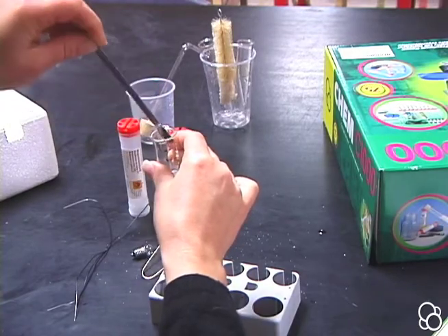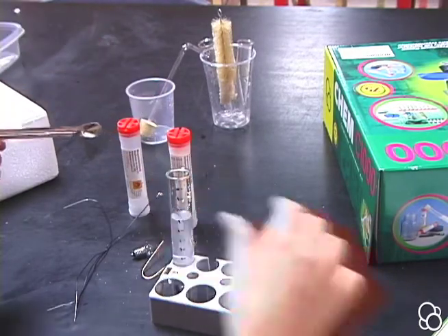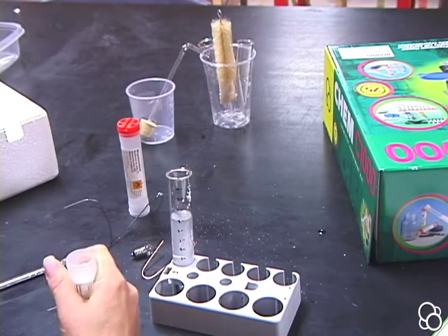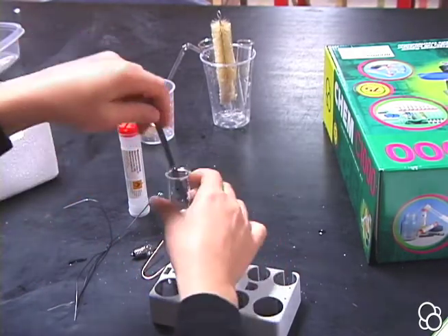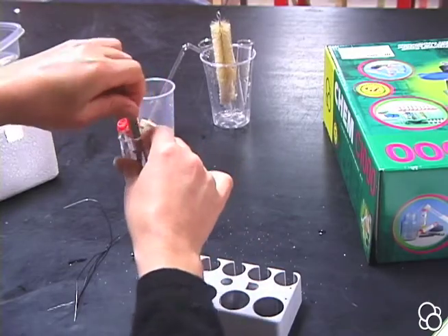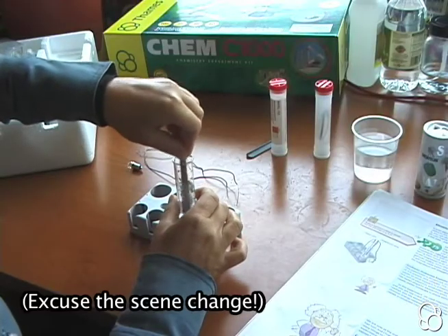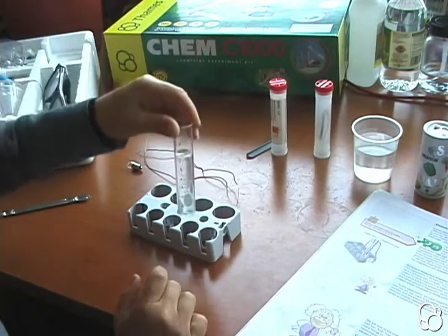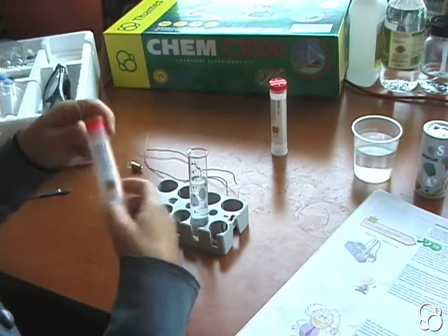Then we're going to add one spoonful of sodium hydrogen sulfate and mix it up. You can tell your audience that it's just water because it looks like water. So take a magnesium strip out of here.